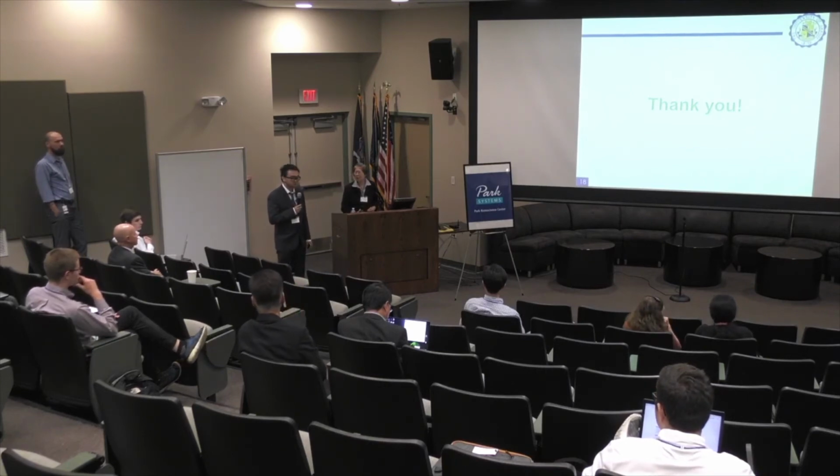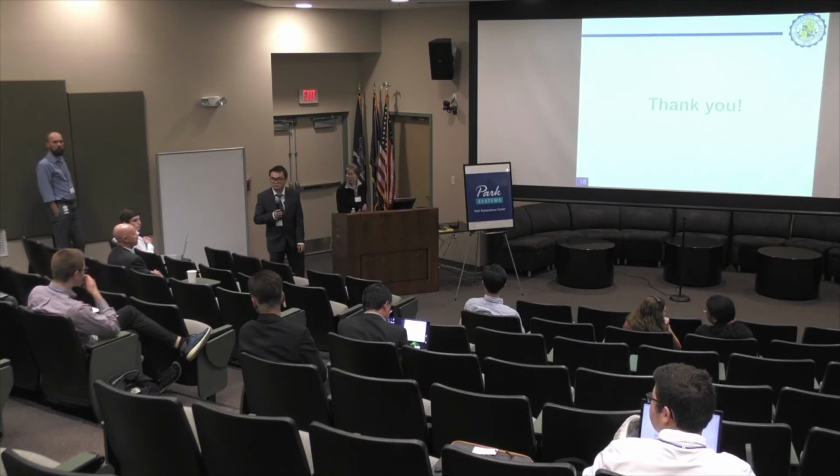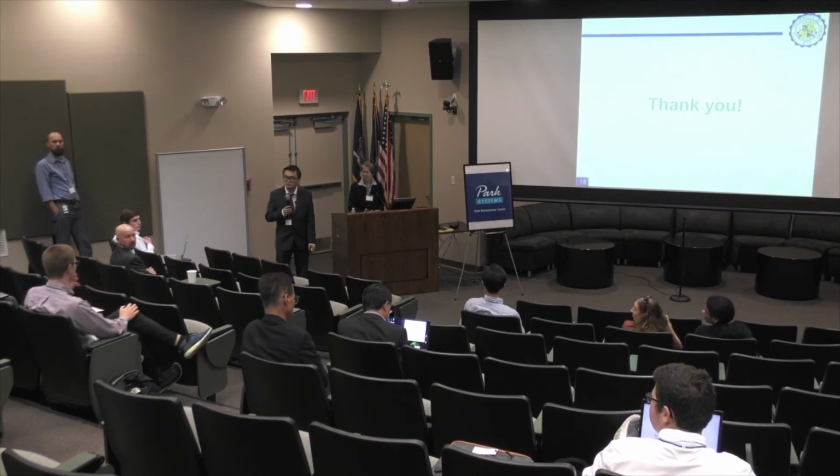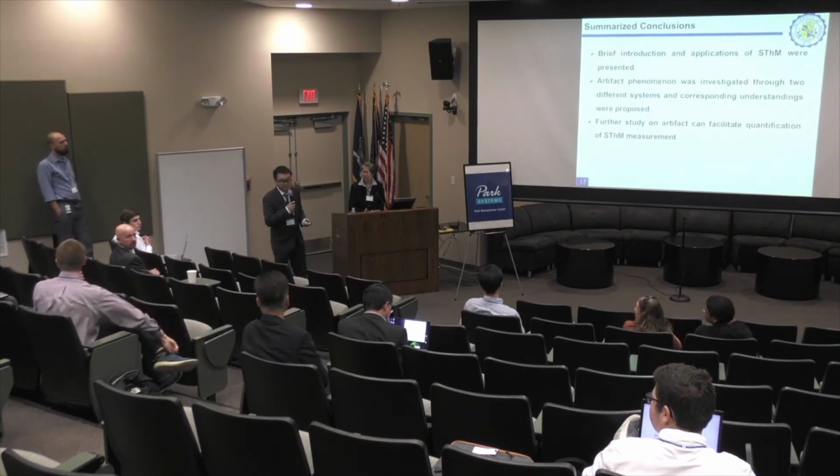Any other question? Has any of the quantification been performed? Because I remember there was corrected data in the other talk that I assumed used some of this information. Yes, that model is only for the polymer uniform system. Okay. So based on different systems, like if we want to test some hard materials, we cannot use that model, maybe.